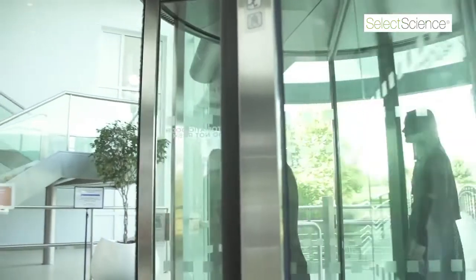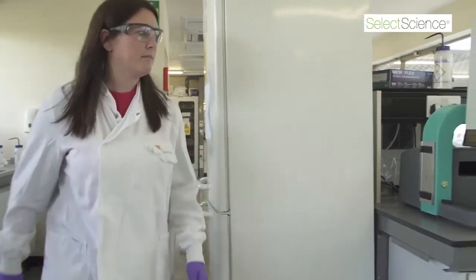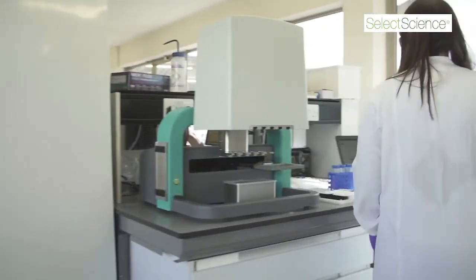So one of the challenges in drug discovery is to reduce overall cycle times, ultimately so we can get medicines to patients faster. And in the early discovery phase where my team and I work, so from identification of a target through to declaration of a candidate molecule, one of the ways that we can help reduce cycle times is by decreasing the time it takes us to develop a quality assay, transition that assay into the screening phase and prosecute a screening campaign to identify chemical starting points.